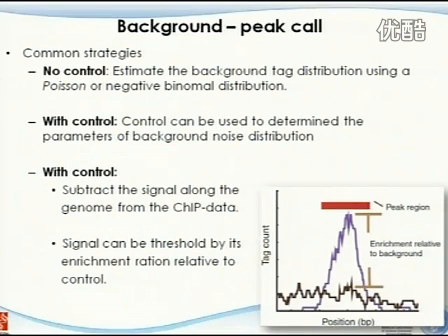It's just like along the entire genome, only a very tiny proportion are the real binding sites, just based on that assumption. I think if you don't do a control, this value is not accurate. You will have to assume that you have enough reads on that. So do we know, for example, what is the on-off target ratio, how many reads are the binding sites, and some of the reads are not?